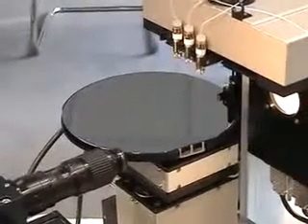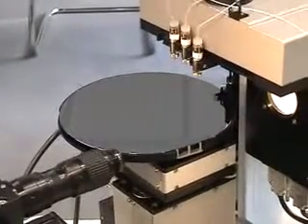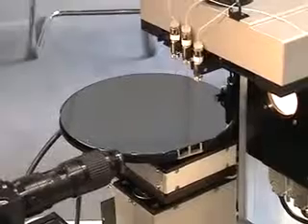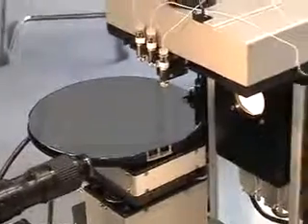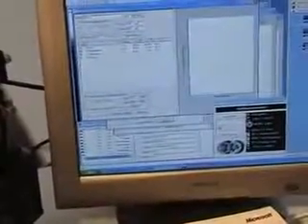So the measurement will become completed very soon. Meanwhile, more windows have been opened and already transferred with the result to Excel. So we can have a look into the result windows at Excel. And in a different tab in the Excel file, we see the results, which can be stored easily on our hard disk.